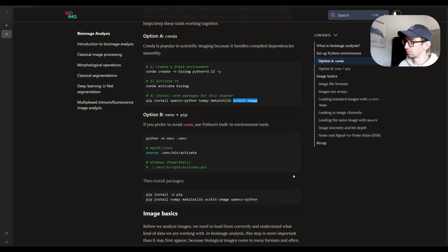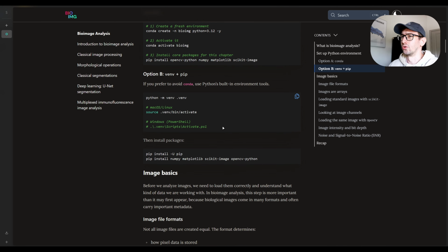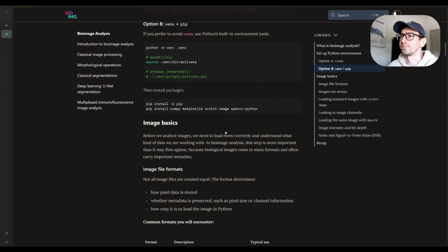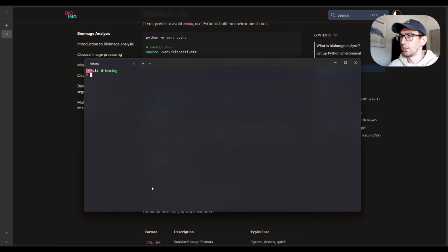because we want... It's getting package metadata, and it's typically not very fast. Okay, yeah, fair enough. As I said, you can use, for example, Pixi as a package manager, or uv, whatever you want. But this one is more common and popular, so it should be good enough for everyone. In my case, I activated and installed everything, and now I'm ready to go.